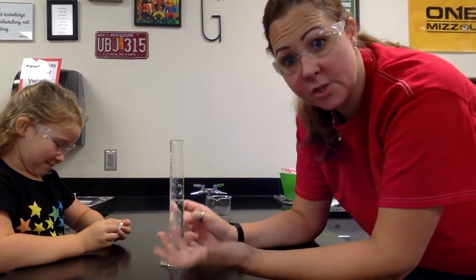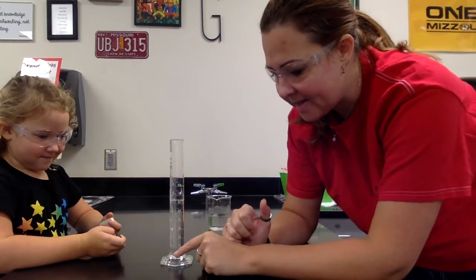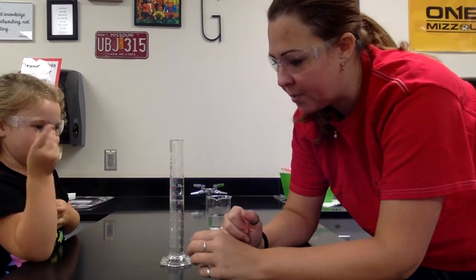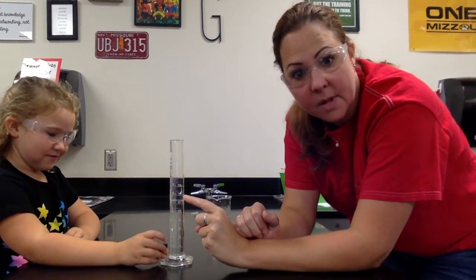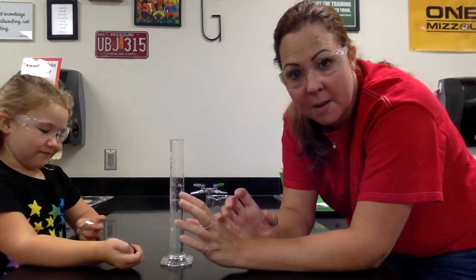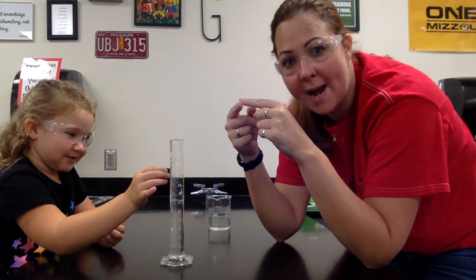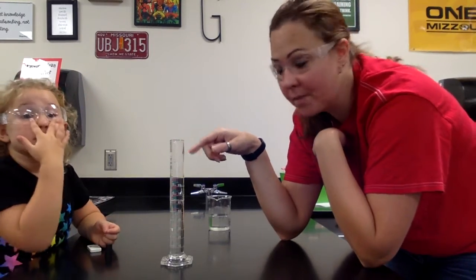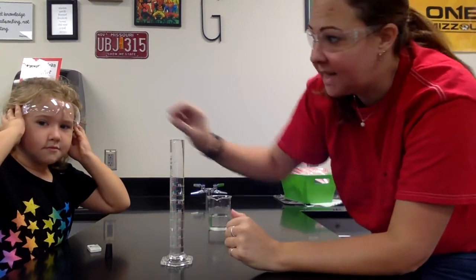So in the procedure that you are reading, it says to just pour water about halfway. It doesn't matter how much water we put in there. And we're recording that value in the data table. So each of your starting volumes might be different, but it doesn't matter because you're subtracting the difference to get the volume of the object that we're measuring. So we're going to take the measurement in milliliters.